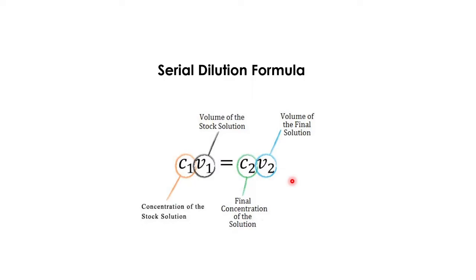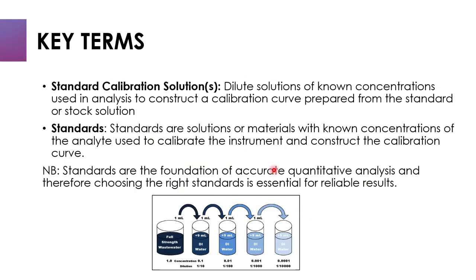Let's look at standard calibration solutions. When we talk of standard calibration solutions, they are the dilute solutions of known concentrations used in analysis to construct a calibration curve, prepared from the standard or stock solution.